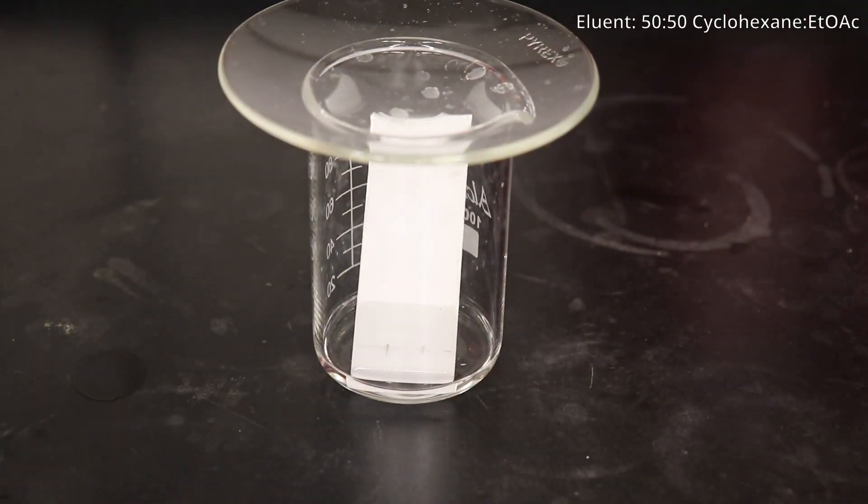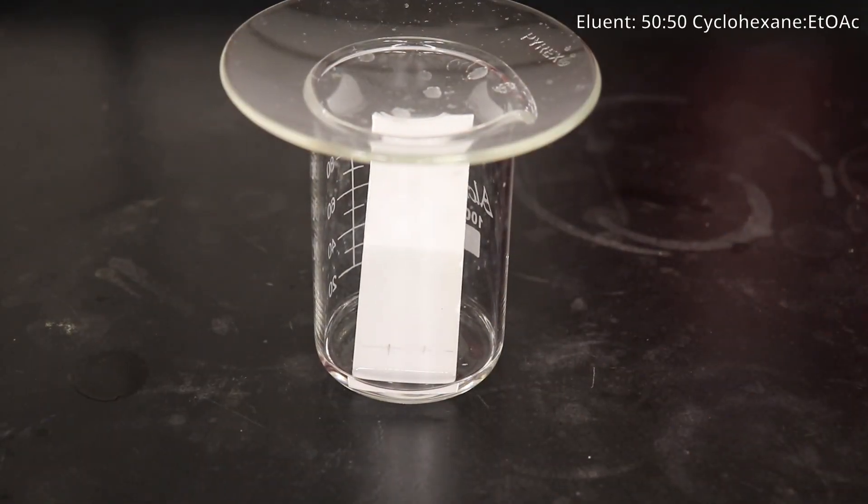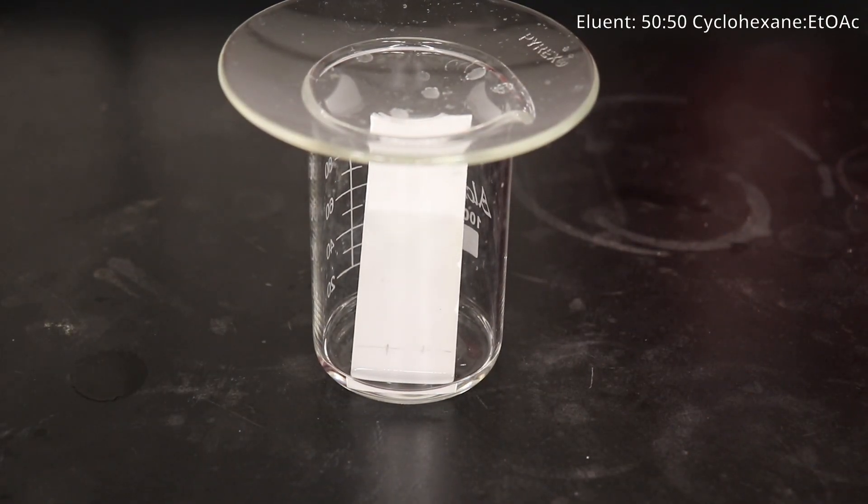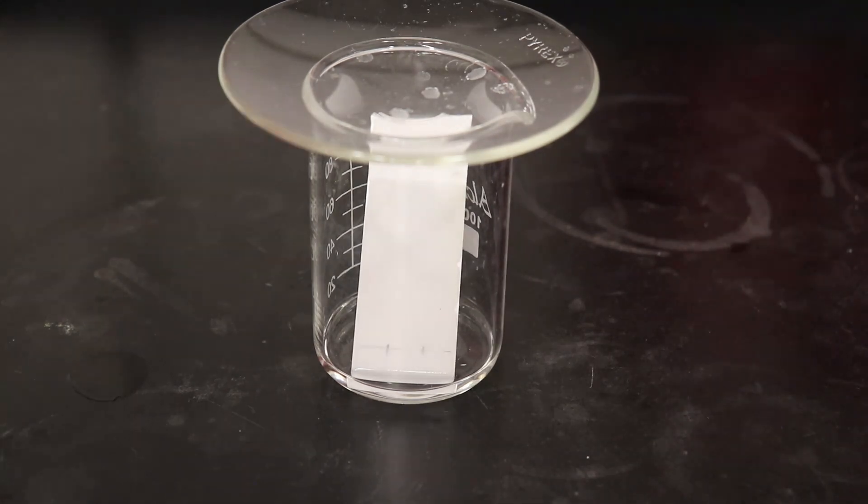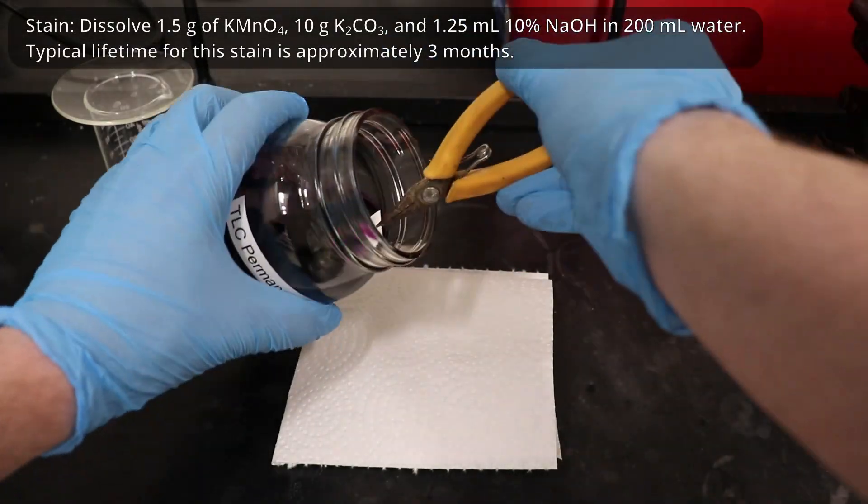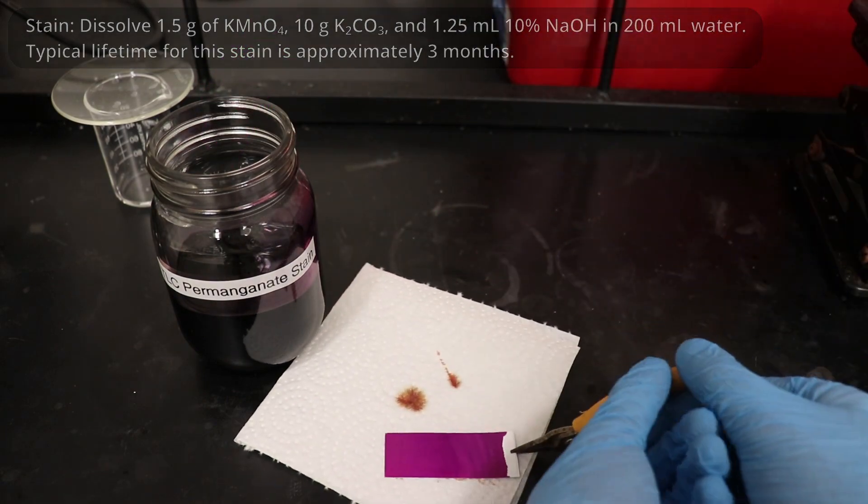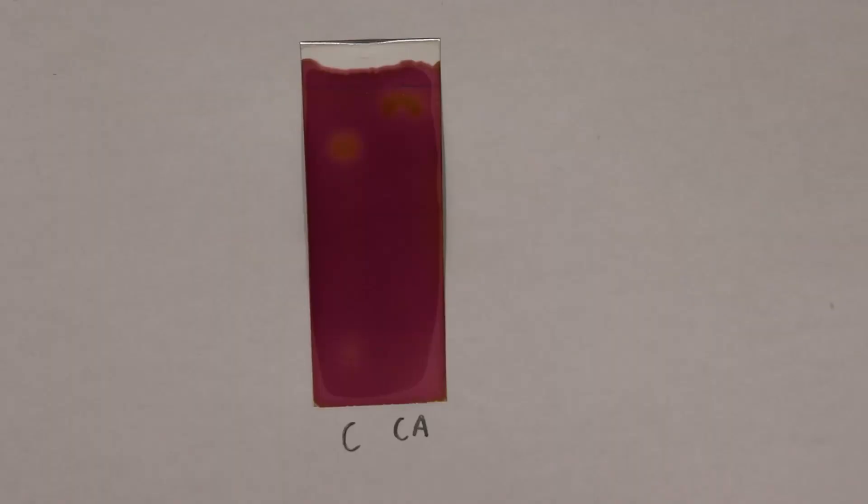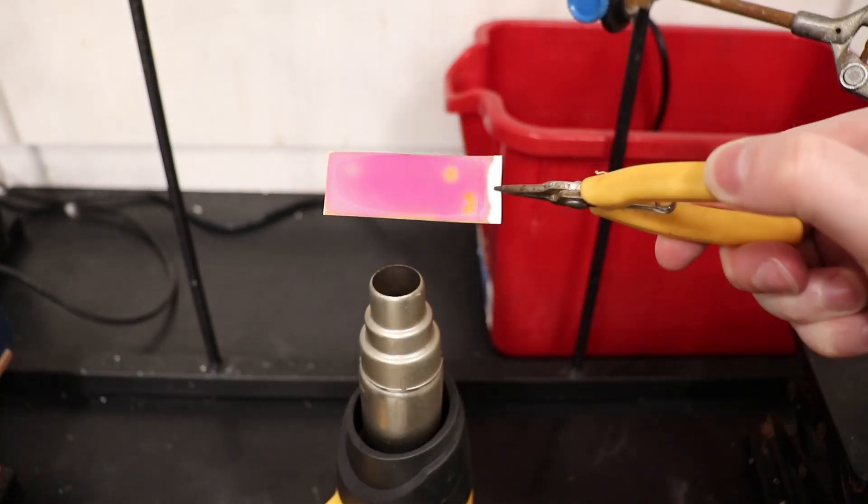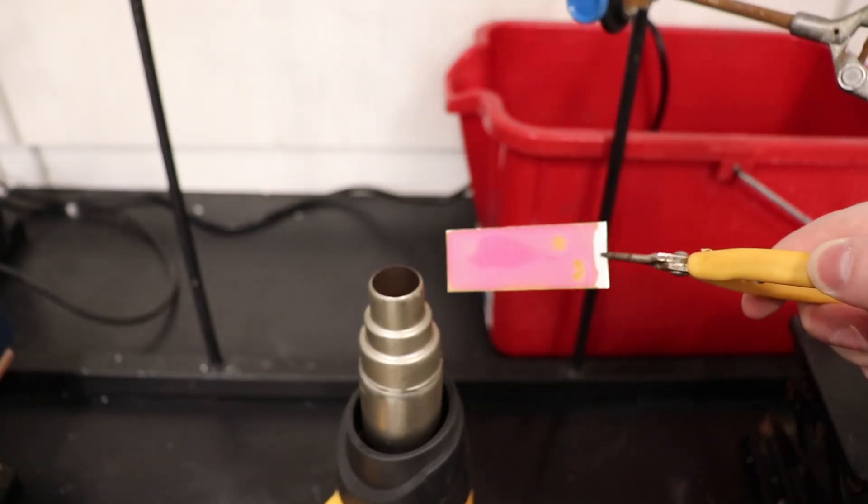Next I ran a TLC against the starting cholesterol to see if there was any starting material remaining in my product. For an eluent, I used a 50-50 mixture of ethyl acetate and cyclohexane. The plate was stained with permanganate, and the yellow spots from the reaction of the permanganate with the alkene in cholesterol and cholesterol acetate can be seen. The stain was developed with a heat gun, making the spots even more clearly visible.